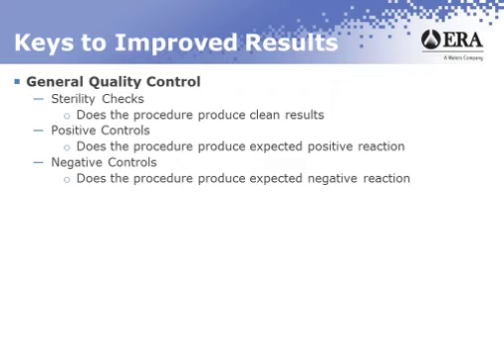A little bit on positive controls, not to backtrack, but I'm going to backtrack. Standard Methods has a variety of cultures that they recommend. You may want to look at those. I've mentioned to you the strains that ERA uses for their PTs and QCs. That may be what you want to use. Your state agency may tell you what you should use. You may be using some of the commercially available methods out there. If you are, you may want to follow that manufacturer's recommendations.